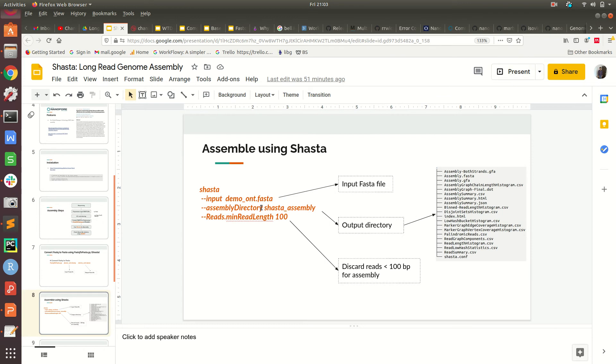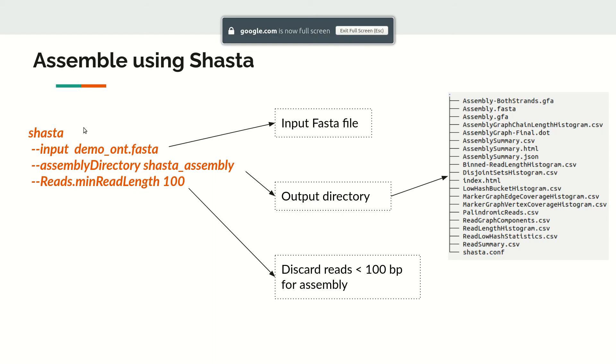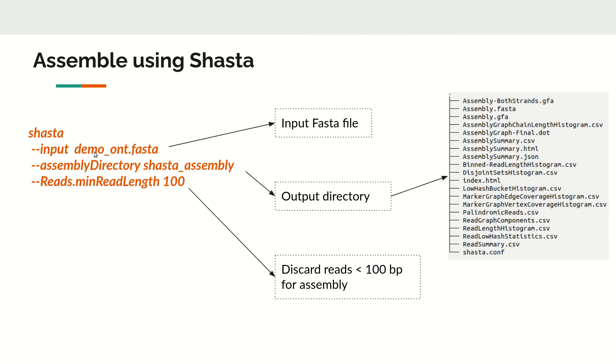Now we run Shasta. The command is: shasta, then the input FASTA file, then an output directory — here we use a folder called shasta_assembly — and a minimum read length parameter of 100, meaning any reads shorter than 100 bases will be discarded. By default this parameter is 10,000 bases, so if you don't specify it, reads under 10,000 bases will be discarded. You should set this cutoff based on your dataset's read length distribution.